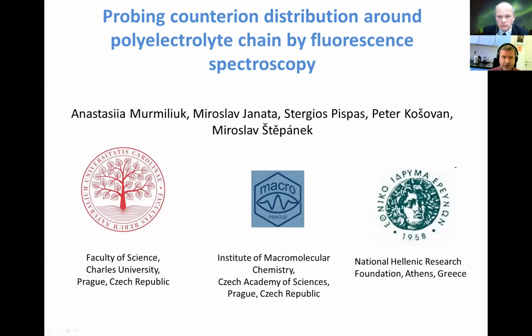Good. Thanks. So I'm going to talk about the application of fluorescence spectroscopy in probing distribution of counterions around polyelectrolytes, and this was a topic to which we use both experiments and computer simulation, because I think that it's quite rare that in our group we do both simulation and various experimental techniques. But still, we needed a collaboration with this other group, mainly in the field of synthesis.